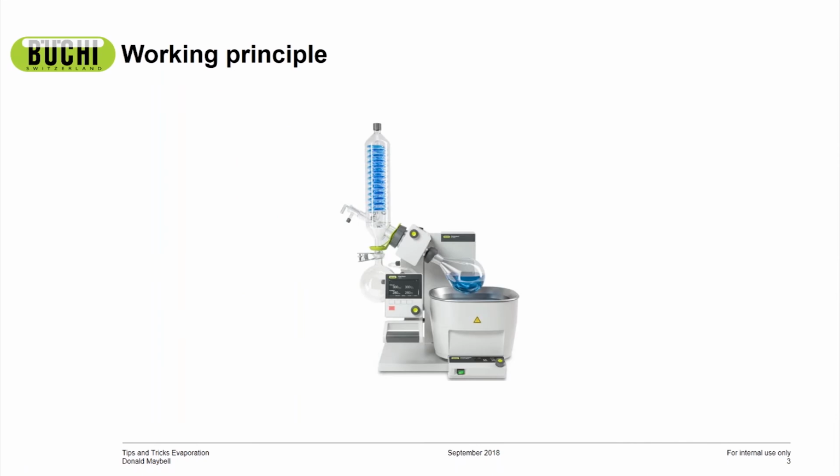So getting right into the mix here, I'm going to go over a little bit of the background, so the working principle, and then we'll hit some more advanced material and show you guys how to properly optimize your evaporation process. So just the working principle and a little bit of background of the distillation process.